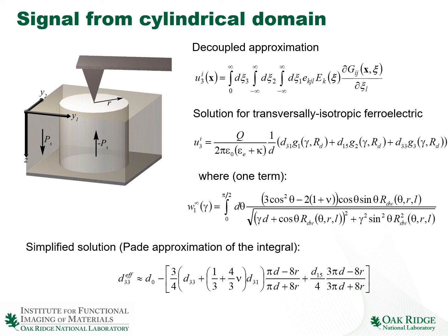Again, in this case, we can use decoupled approximation. We find a solution for transversely isotropic ferroelectric, and we can use the Pade approximation. So this is essentially the expansion in the polynomials to get the approximate formula that gives us the measured piezoelectric signal from the cylindrical domain.